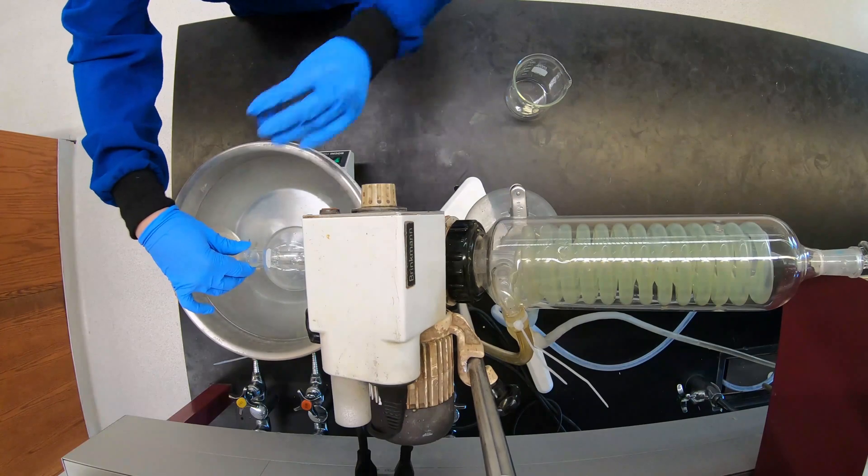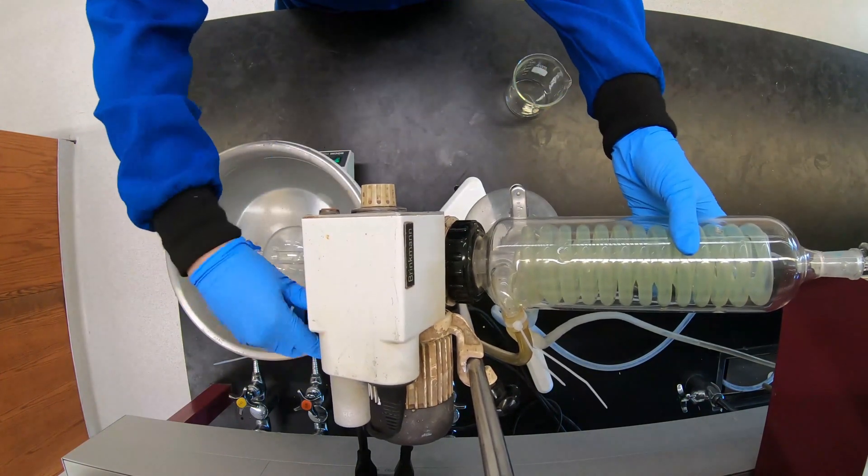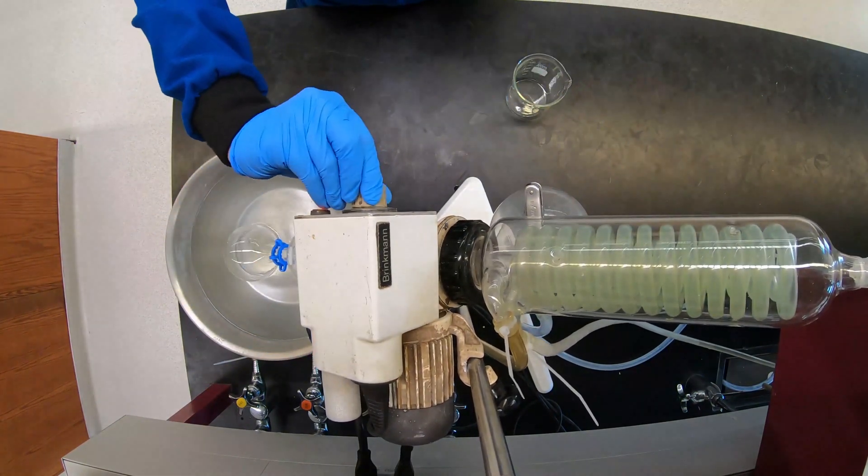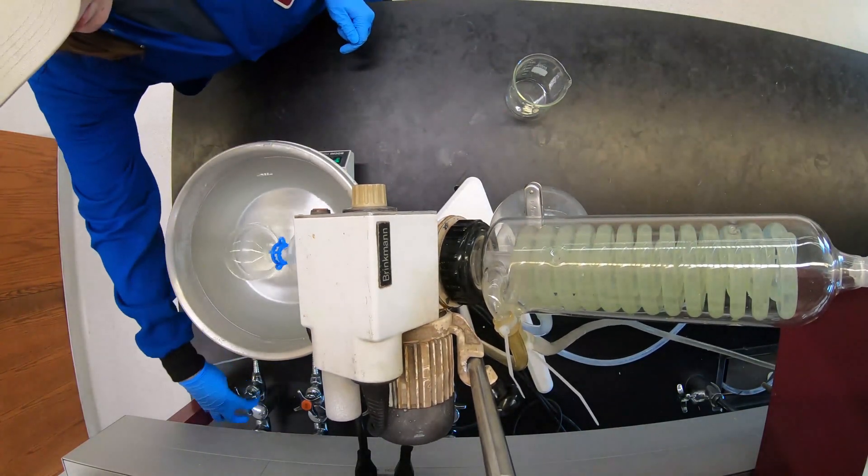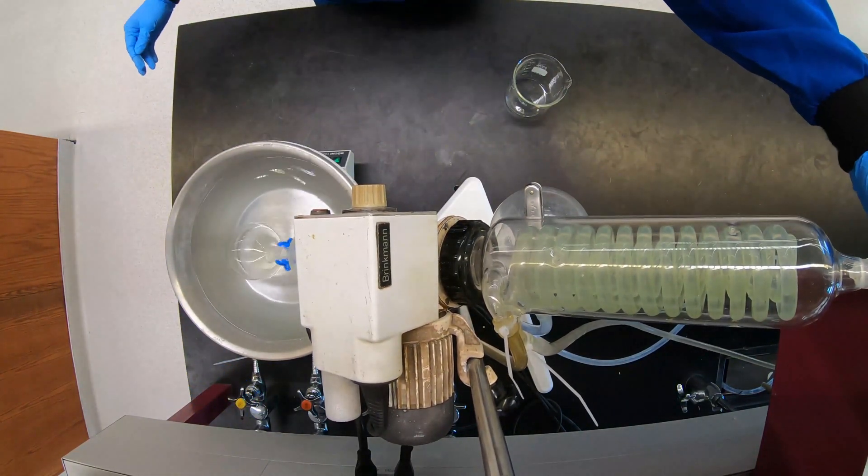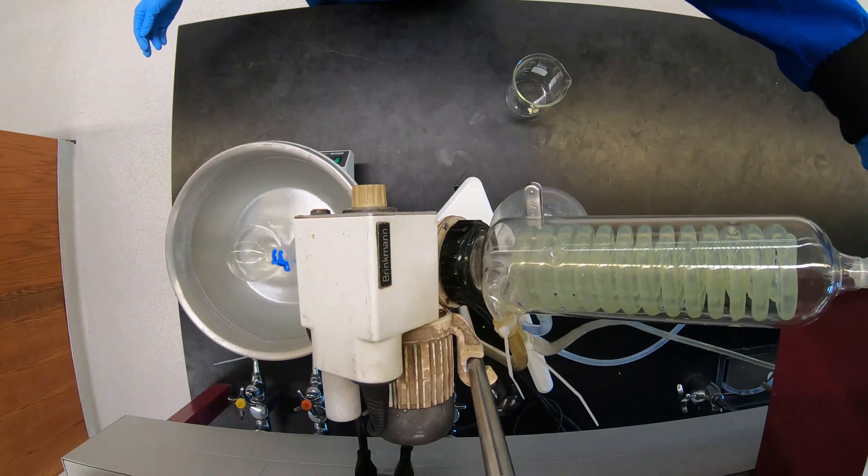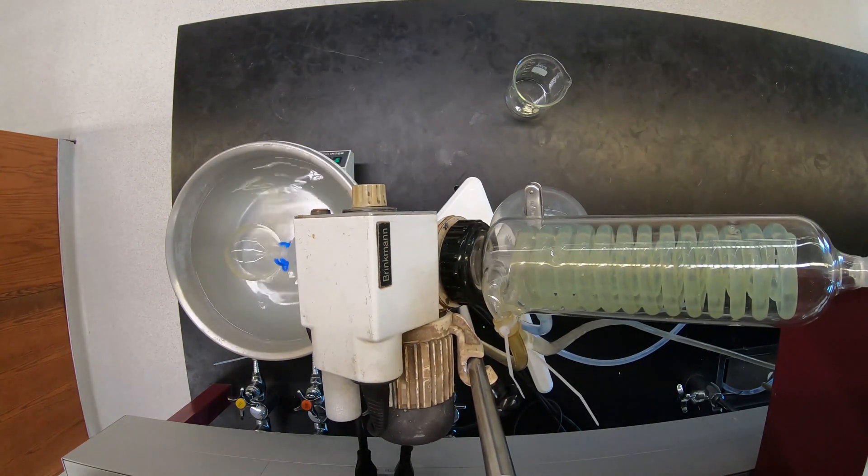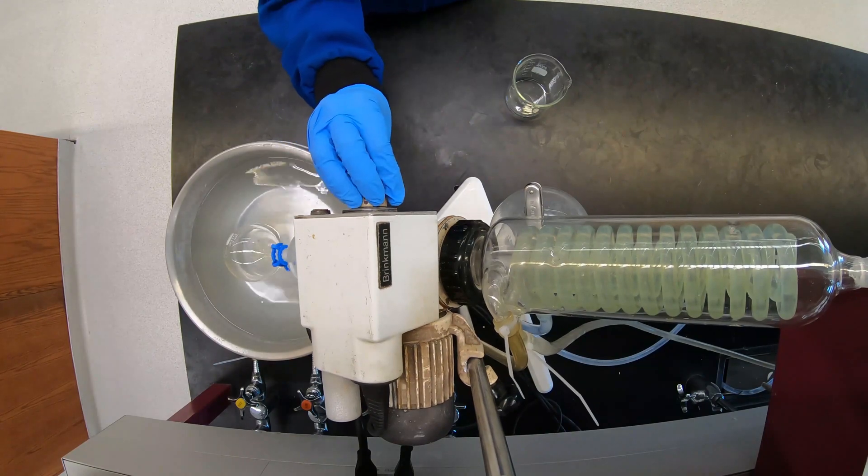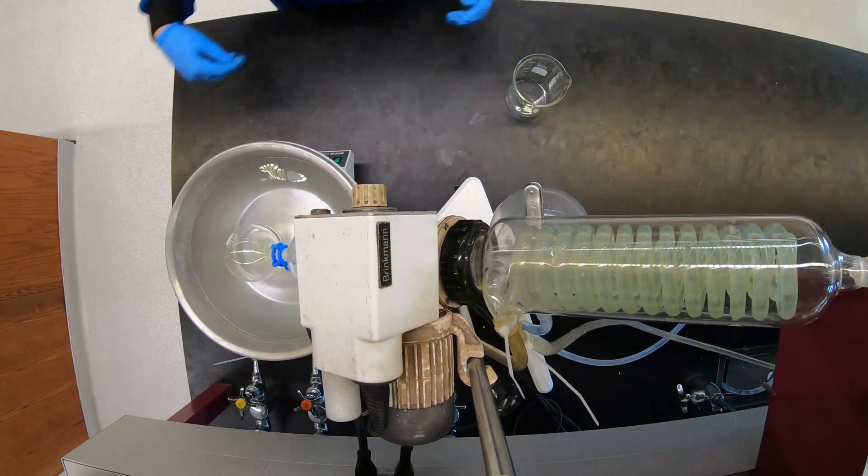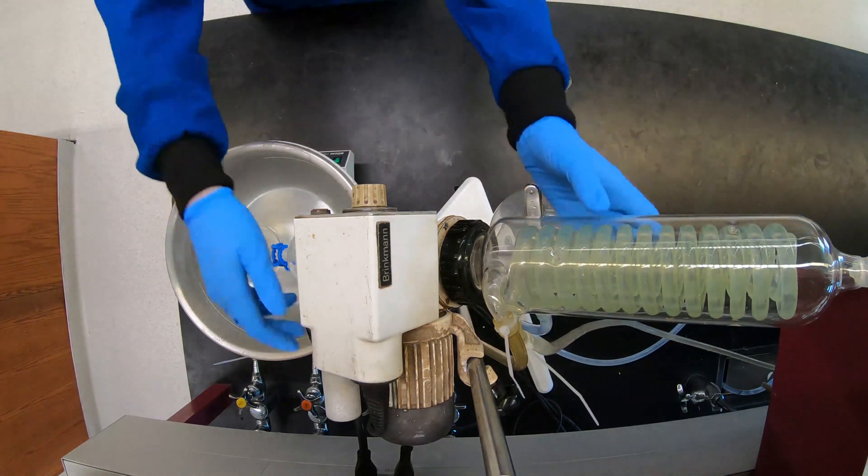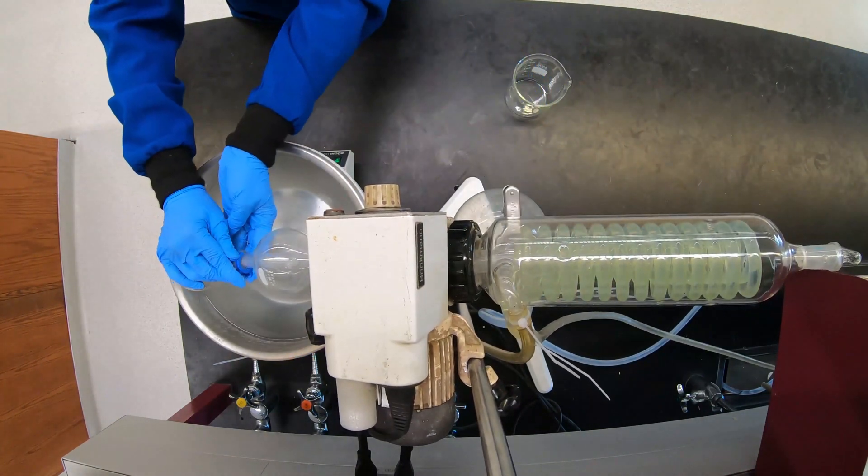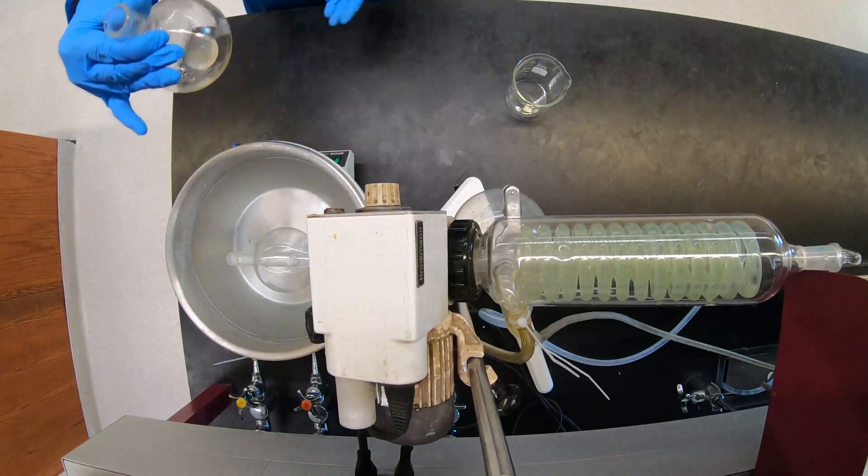To do this, we're going to attach our round bottom flask and twist the joint. Clamp with your keck clamp. Check that the venting stopcock is open. Turn on the vacuum until you can hear it. Turn on the rotation and then close the vent line by twisting the stopcock. Once the ether is removed, you'll vent the system, turn off the rotation, and then turn off the vacuum. You're expecting your crude DEET product to be an oily residue. Store your crude product in your drawer until next week when you'll purify your product by column chromatography.